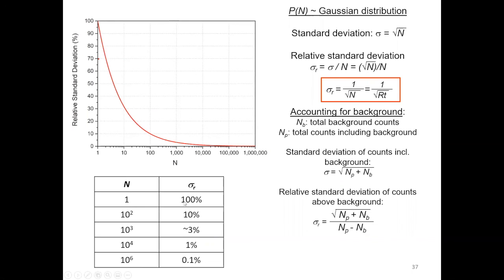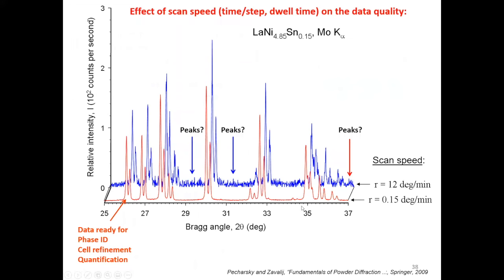In this case here, look at how noisy the data is. There is even some kind of noise in the data here that you don't know if it is a peak or not. The accuracy of the peak shape is going to be poor, especially at low intensity, and quantification is not going to come out any good. For a quick and dirty run where you want to find out where your peaks are, or identify them, it's pretty good, or like a preliminary scan.